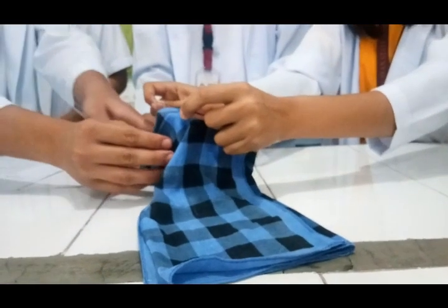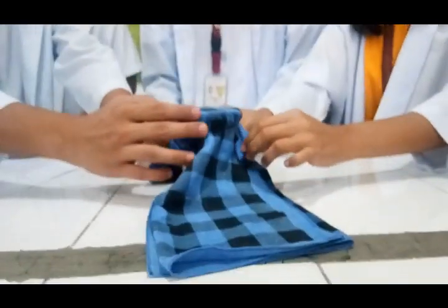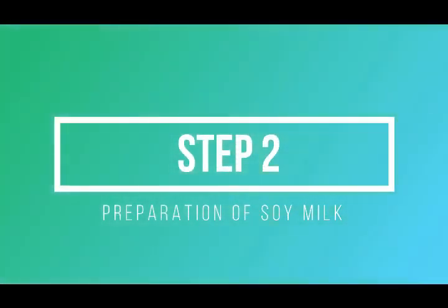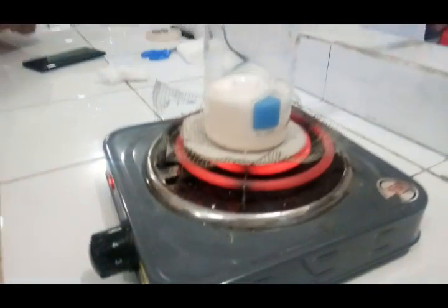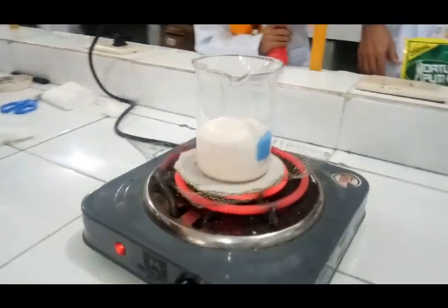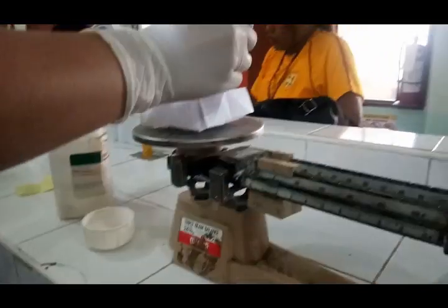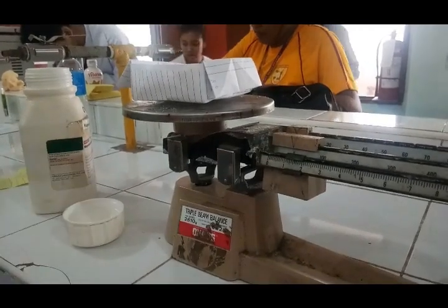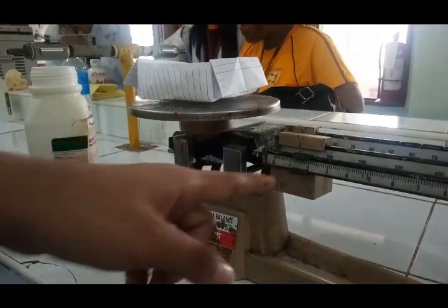Next thing that we need to do is to recover the curds. Our cloth will do the trick. We mounted our cloth on the top of the beaker and filtered our curd. The next step for us is to prepare our soy milk. Similarly, we heated our 120 ml beaker with the soy milk in it, but this time, we allowed it to boil. Our reagent would be magnesium sulfate in this case, in order to precipitate the protein. 1.6 grams of magnesium sulfate is used.